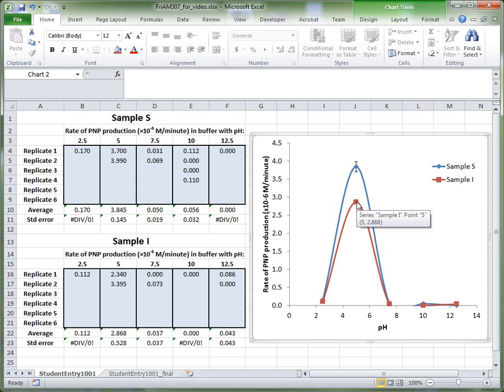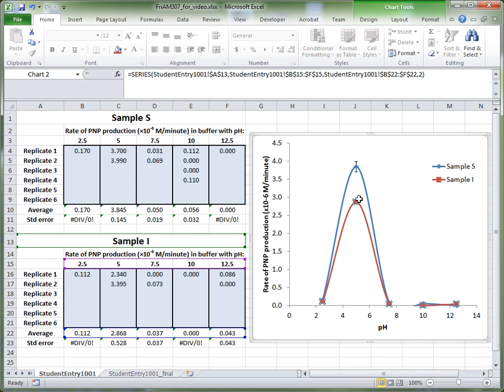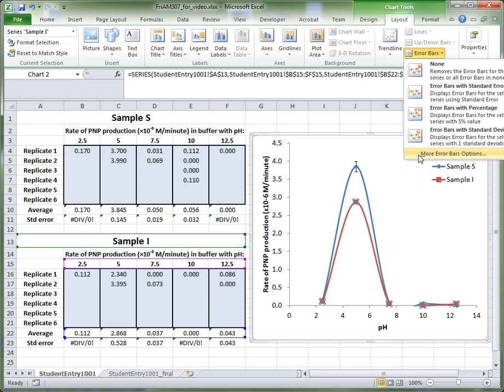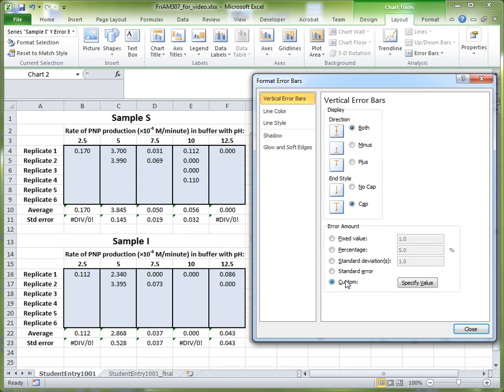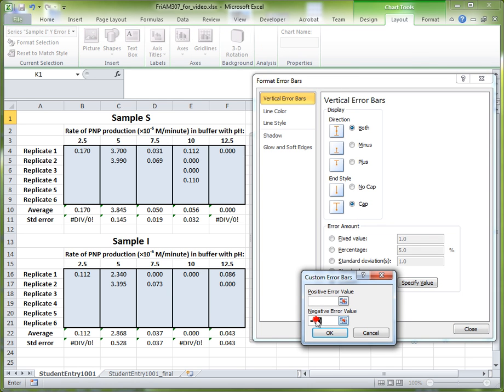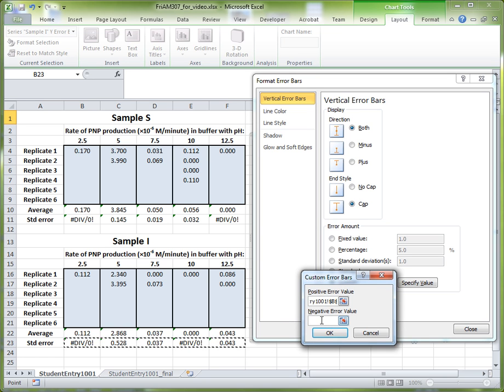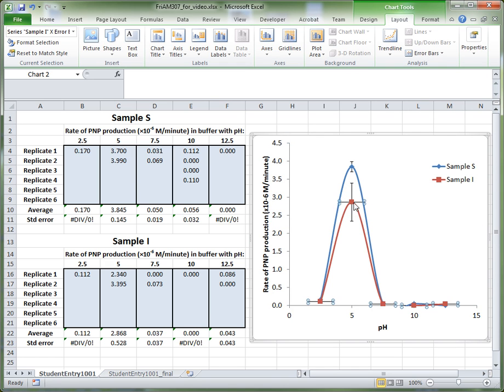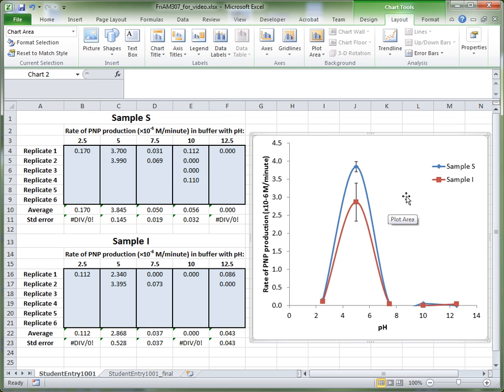The next step is to add error bars for the other series. Click on sample I, go into Chart Tools Layout, go to Error Bars, go to More Error Bar Options, go to Custom error amount, and specify the values. Delete what's there currently, and set the positive and negative error values to the standard error for the sample I replicates. Again, Excel may plot horizontal error bars — just select them and press Delete to remove them.